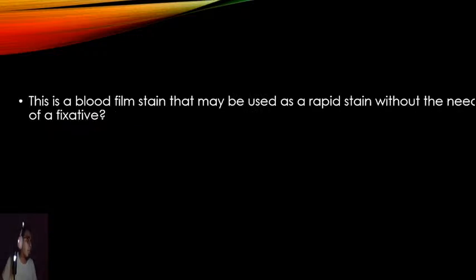All right. Next. This is a blood film stain that may be used as a rapid stain without the need of a fixative. This one is the one that I'm always familiar with. If you see the word rapid stain, that would be your keyword, without the need of a fixative. By the way, before we answer this question, what is the best fixative?